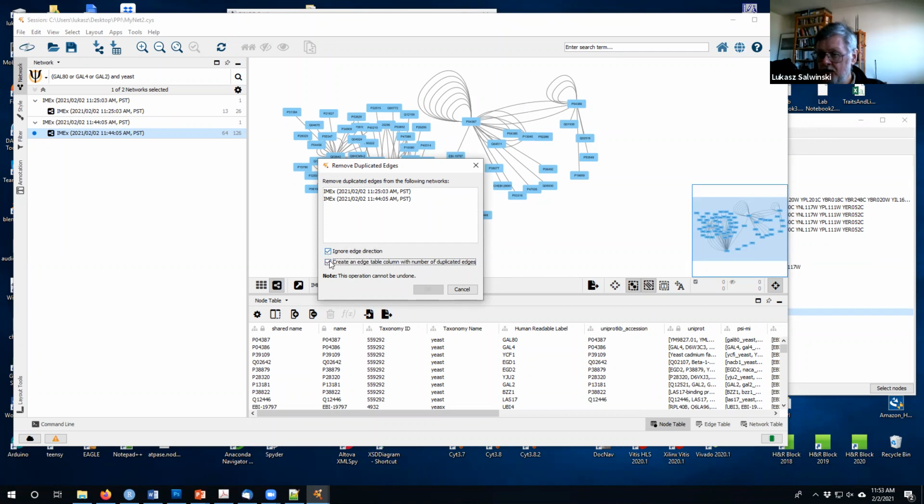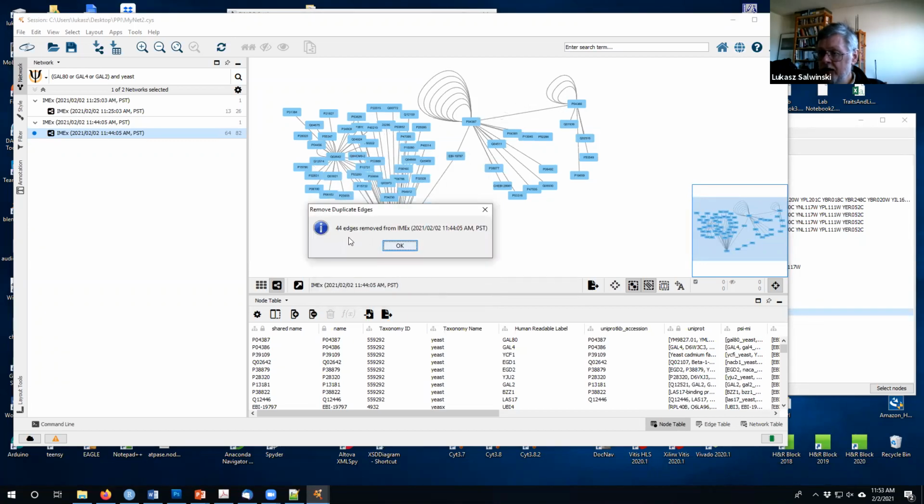Okay, so let's check both things here. Let's decide we want the second one. So this is 4405. So this is the one that I want to collapse. And now let's go here and do okay. Okay, and now we lost 44 edges.